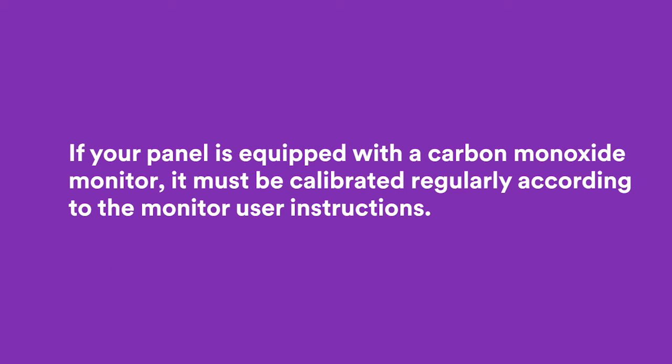If your panel is equipped with a carbon monoxide monitor, it must be calibrated regularly according to the monitor user instructions. Although it is possible for oil-lubricated compressors to create carbon monoxide if the compressor overheats, studies have shown that the location of the compressor's air intake is the most likely source of carbon monoxide.